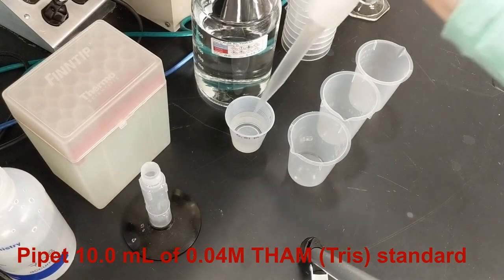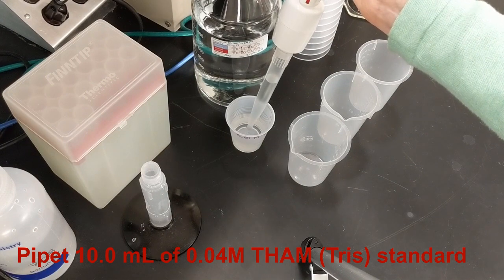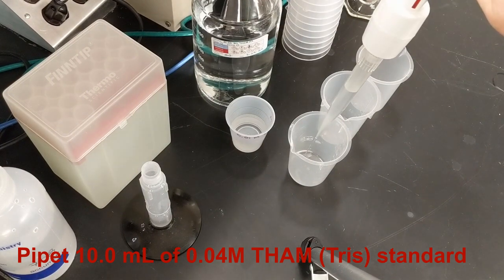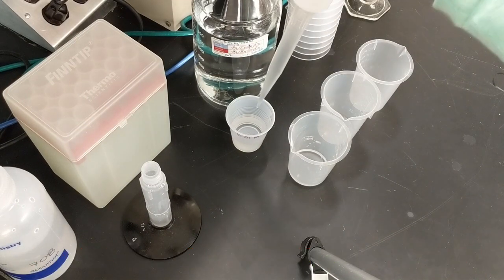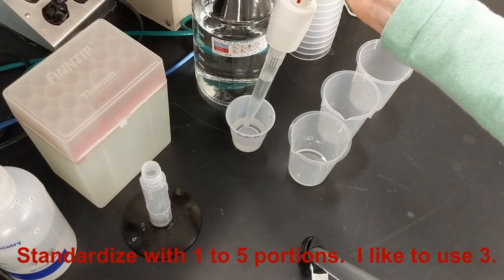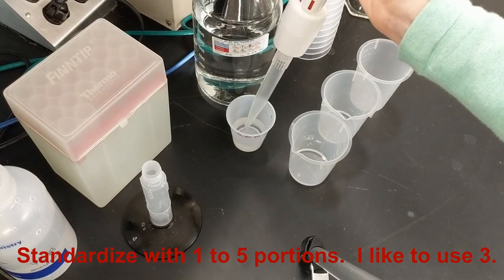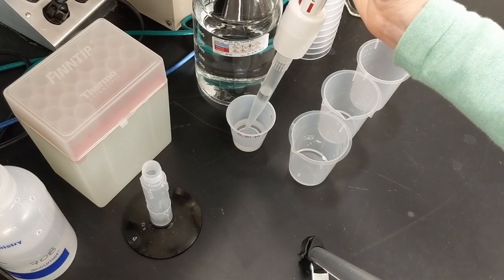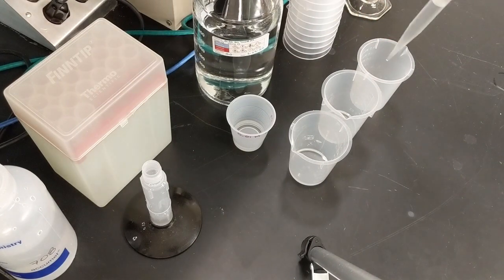To start the standardization, I'll pipette exactly 10.0 mils of the 0.01 molar THAM, or Tris standard, into a clean beaker. I can standardize with one to five portions of standard. I like to use three portions, so I'll repeat the pipetting until I've prepared three beakers. Titrating three portions of the standard increases my confidence in the standardized value that will be determined for the titrant, and increases the accuracy of the subsequent sample titrations.